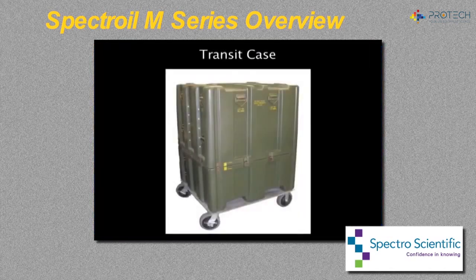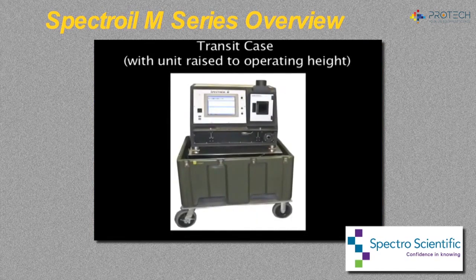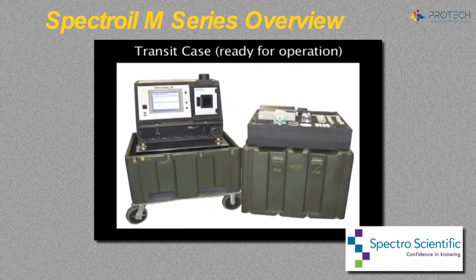The SpectrOil is designed to operate in harsh environments and performs equally well in a laboratory or on-site, where immediate oil analysis results can be vital and sample turnaround time is crucial.